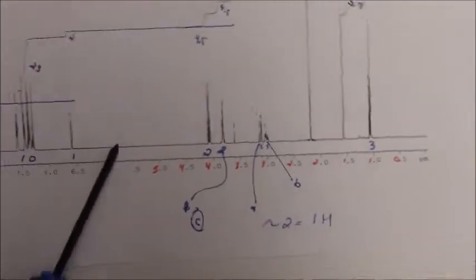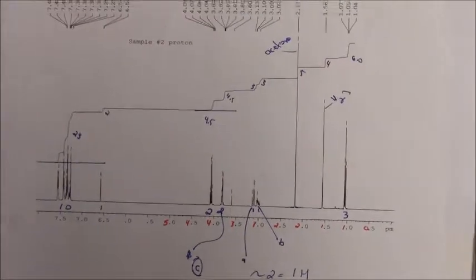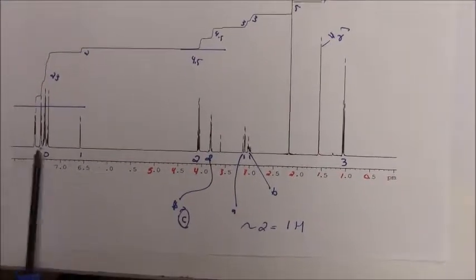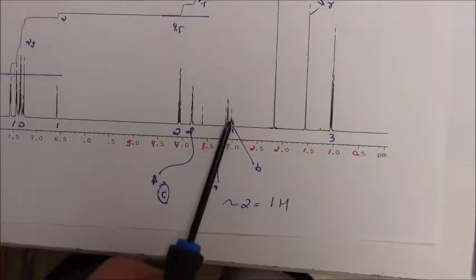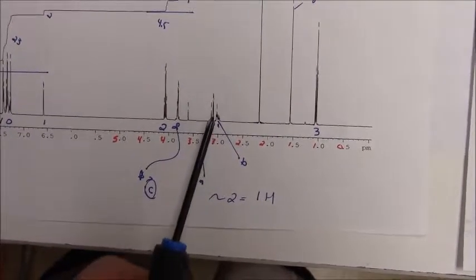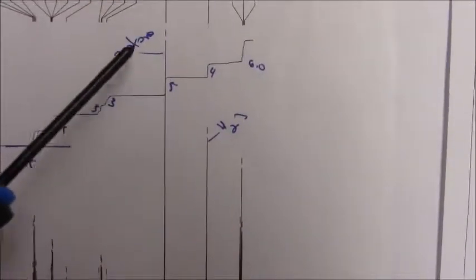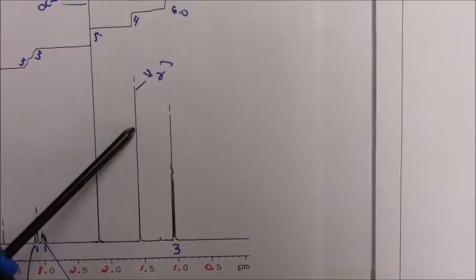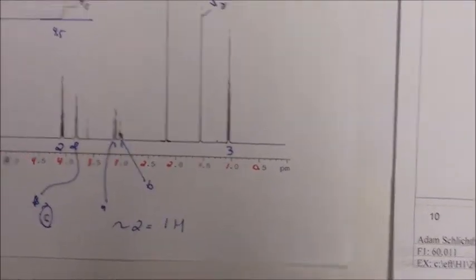This is what it looks like. And I think you can already, this is posted on Blackboard, so you should still see the same one. All of these hydrogen peaks, they might start overlapping with each other, okay? Just remember that some of these peaks, like this was acetone, right? And this one right here, on the day I ran mine, was water. So these two do not belong, and that was indicated.